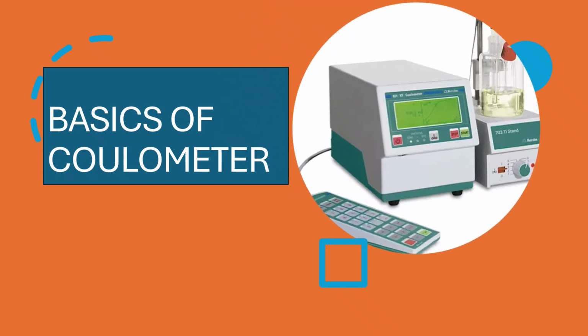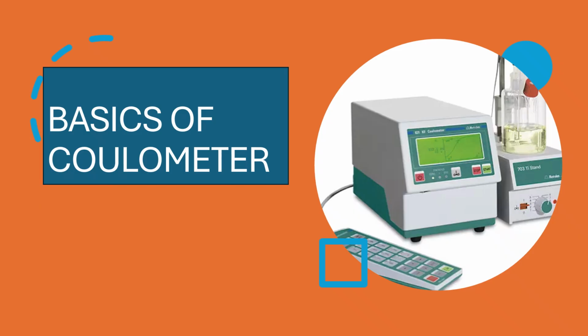So today we will discuss the coulometer, which is an important analytical instrument widely used for precise determination of water content. The coulometer is based on the fundamental concept of electrochemical titration. Let's have a look at this coulometer instrument.